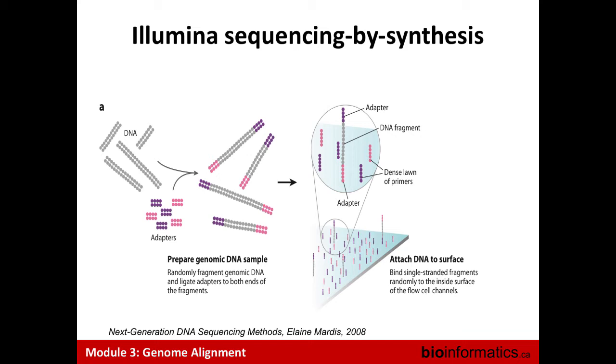The main idea of that technology is you take your DNA and cut it into fragments where you approximately know the size of the fragments you generate. You already talked about that in the previous lecture. So you decide which fragment you want. On this fragment, you add adapters at the two ends. You load this fragment on your flow cell. In your flow cell, you have corresponding probes for the adapters, so the molecule will come and fix to this adapter. So you will have all these DNA strands attached to the surface of your flow cell. So your flow cell will not be empty.